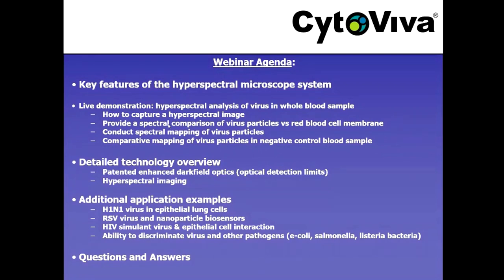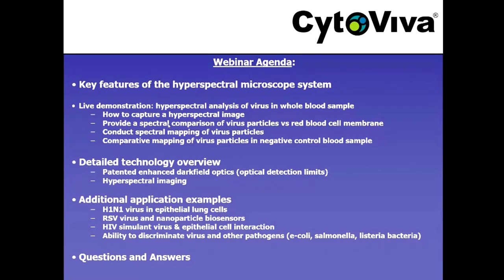We're going to focus first on the key features of the hyperspectral microscope system for those not familiar with the technology. From there we'll go straight into a live demonstration conducting hyperspectral analysis of virus particles in a whole blood sample — showing spectral identification and comparison of virus particles versus red blood cells, and comparative mapping of virus particles in positive versus negative control samples.